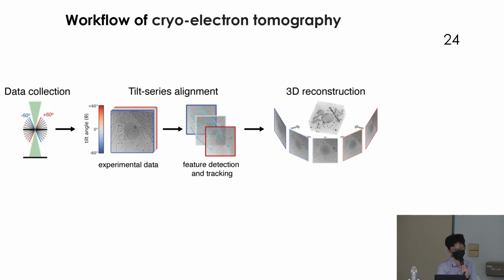But something worth noting is why the electron microscope is getting more popular, and why the sample really has to be cryopreserved as a key factor. So far, although the electron has very good potential because of its smaller wavelength, we cannot build a perfect microscope. That's one reason the resolution is still about an angstrom. It's not like 0.2 or 0.01 angstrom. There's still some restriction. Another key factor is how you prepare your cryo sample.